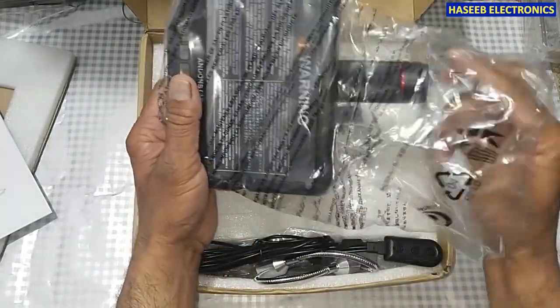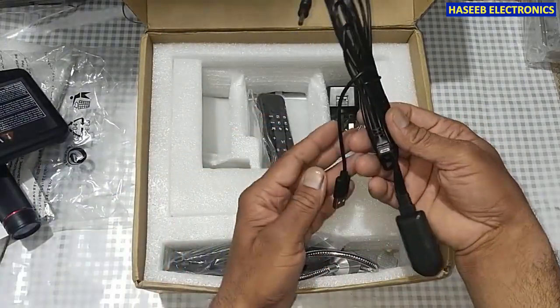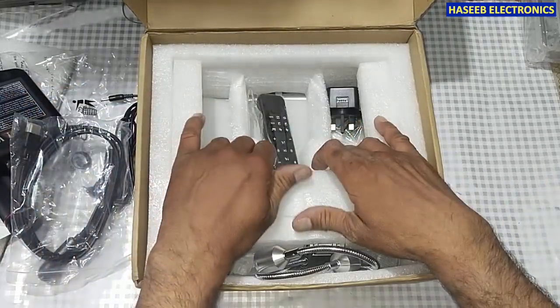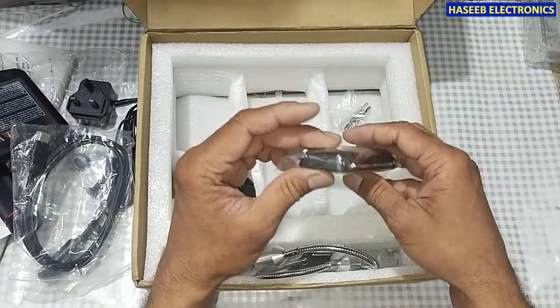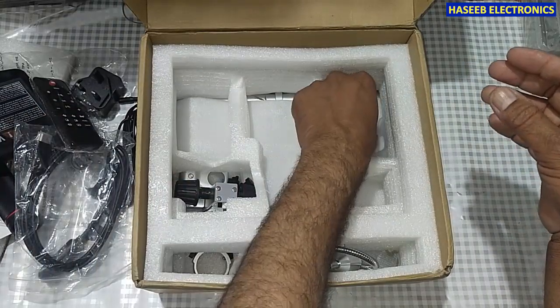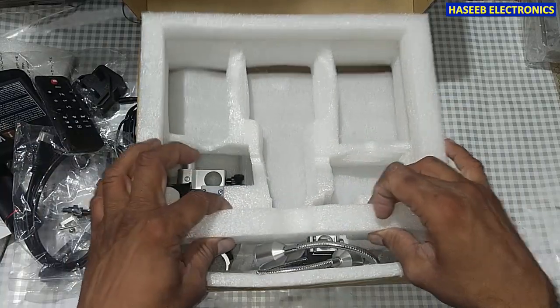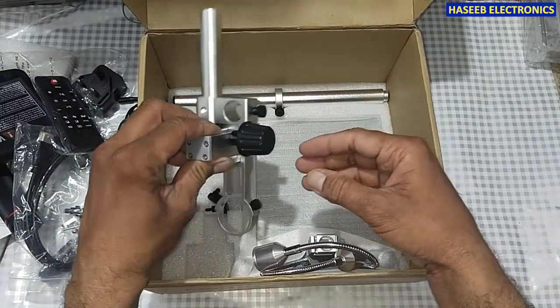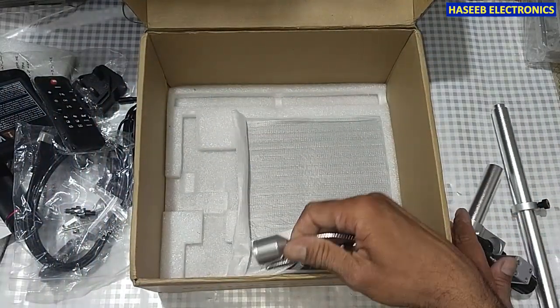Here is the display and the microscope. Here is the HDMI cable, the input power adapter, remote control, LM key and different attachments, knobs, stands and different attachments, and its base.